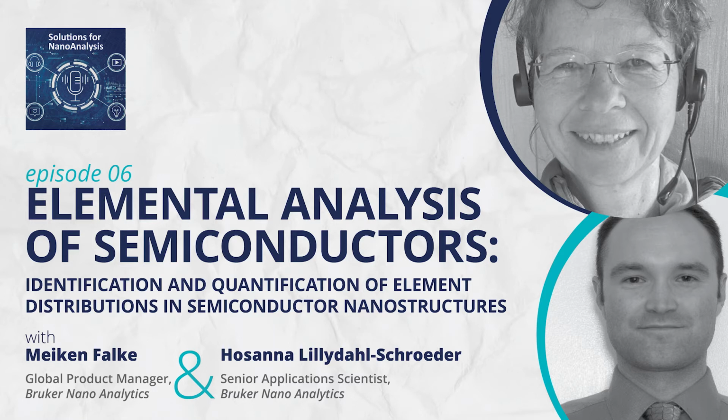And it has been shown also to be working in cryo samples, frozen in vitreous ice, for instance. Also forensics comes to mind, art and conservation, old stuff, what does it contain? So anywhere where many elements need to be identified, and all these topics might be used for next podcasts maybe. And thinking of life science, life on Earth, there's this little remark on space.